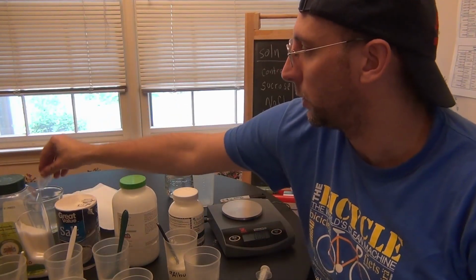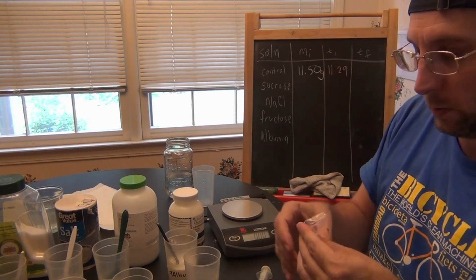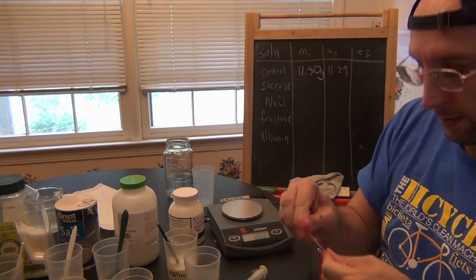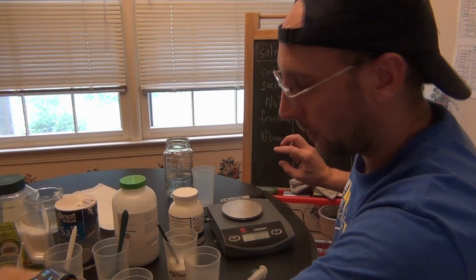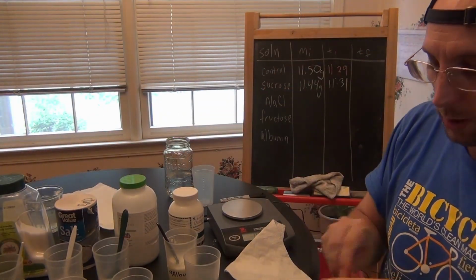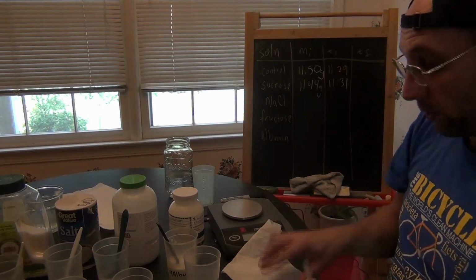I'm going to grab a dialysis tube, put a knot on one end, other end. Other end. I need to clean out this container now because I only have one. Yep. And also two left. You can go right out.